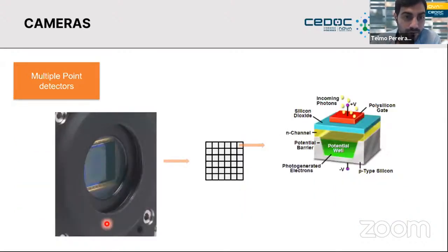So traditionally, the heart, as I already told you, is the sensor. The sensor is just an array of rows and columns of different elements. Usually each element is similar to an APD detector, so it contains the same photosensitive material. It consists of a silicon semiconductive material.